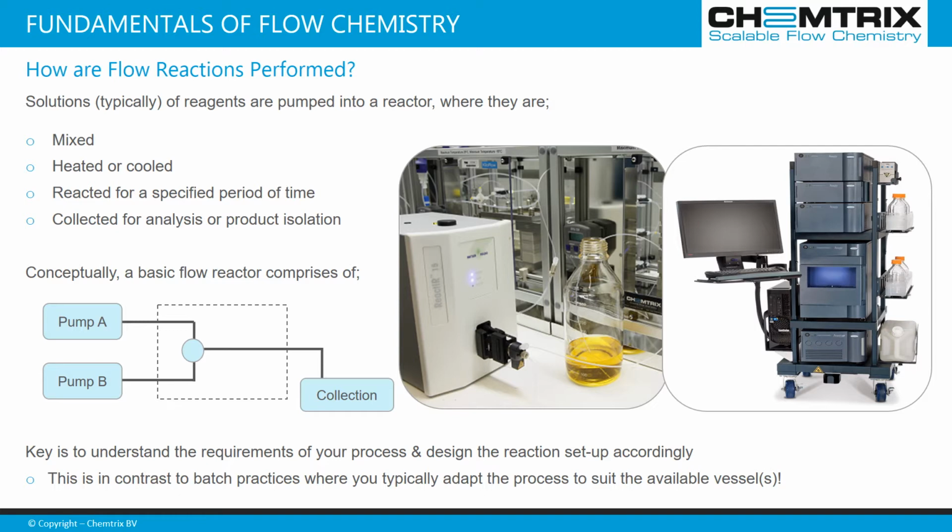You can see a couple here in the photographs. We've got a FTIR, which is a flow cell at the outlet of the reactor, or a Waters Patrol system that's taking sample aliquots and analysing them by UPLC. The choice of PAT, as we'll look at through this presentation, is dependent on the product that you're making and the process sensitivity that you're wanting to guarantee.